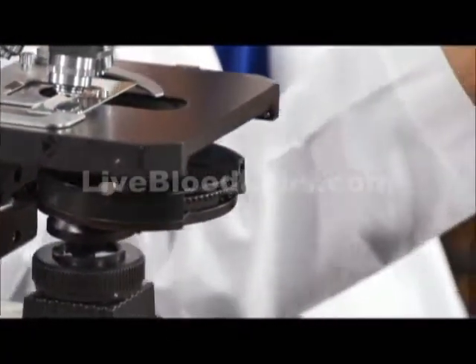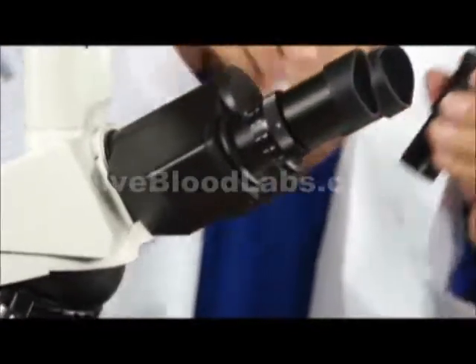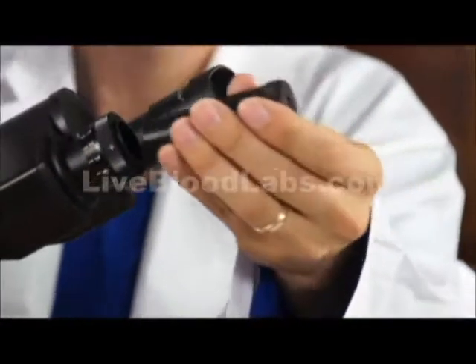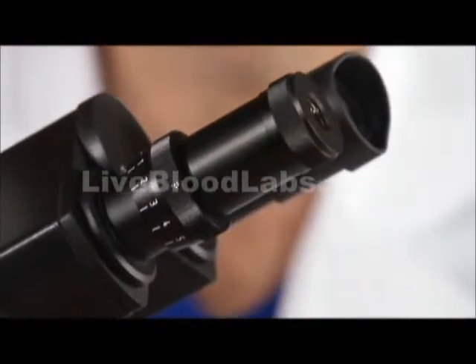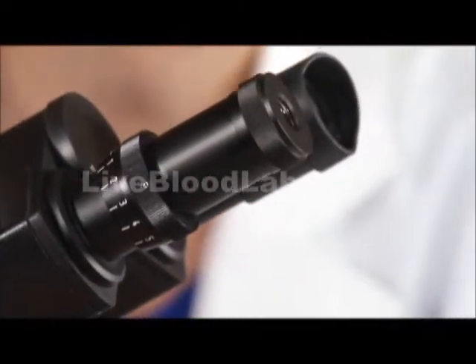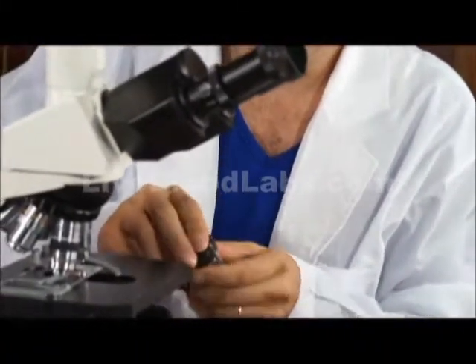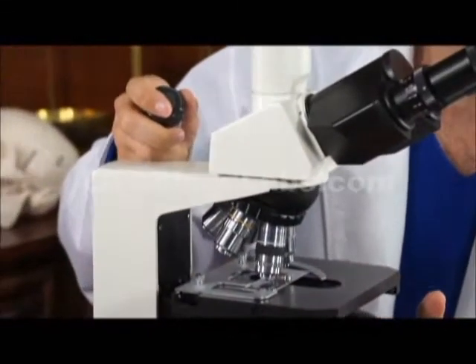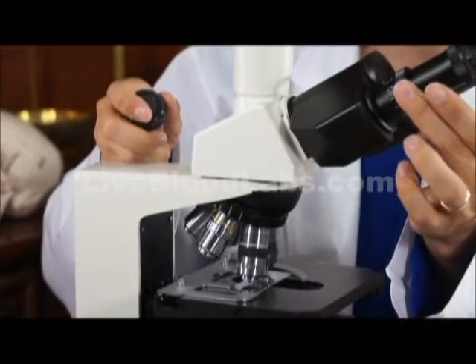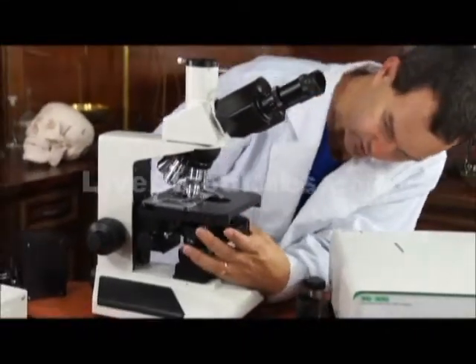We have a phase telescope that's used in the ocular — it's used to center the phase rings. You have to put on the phase contrast objectives. If you have a 40x phase objective, then you turn it to the 40x setting and you center the phase annulus rings.